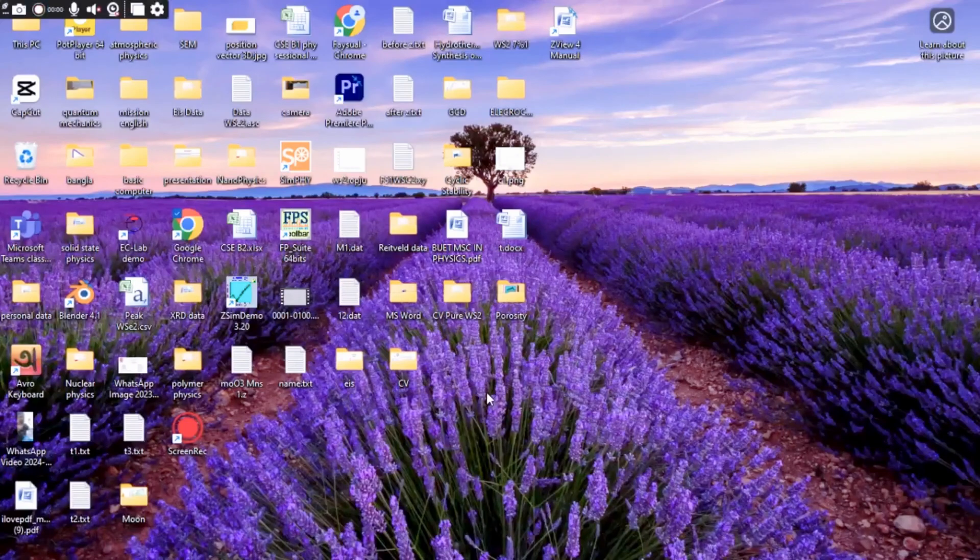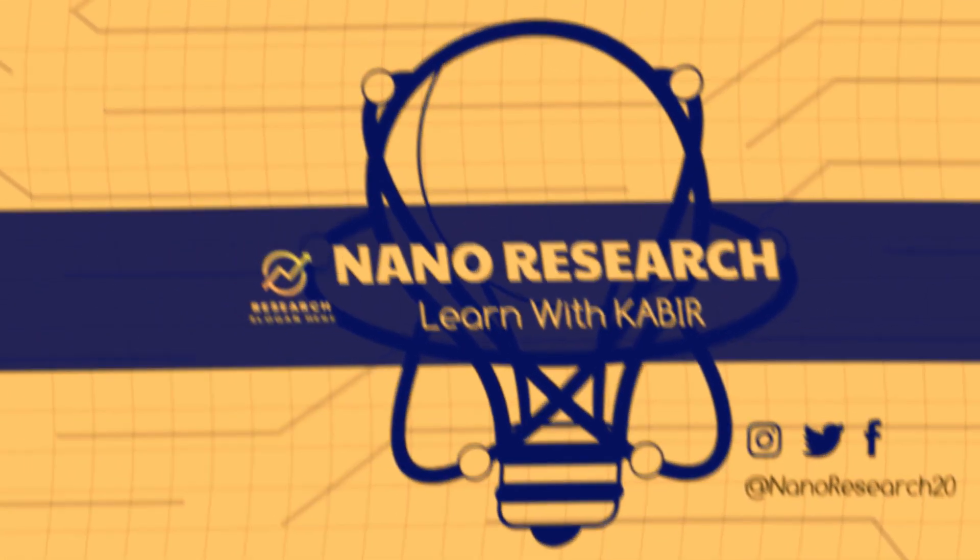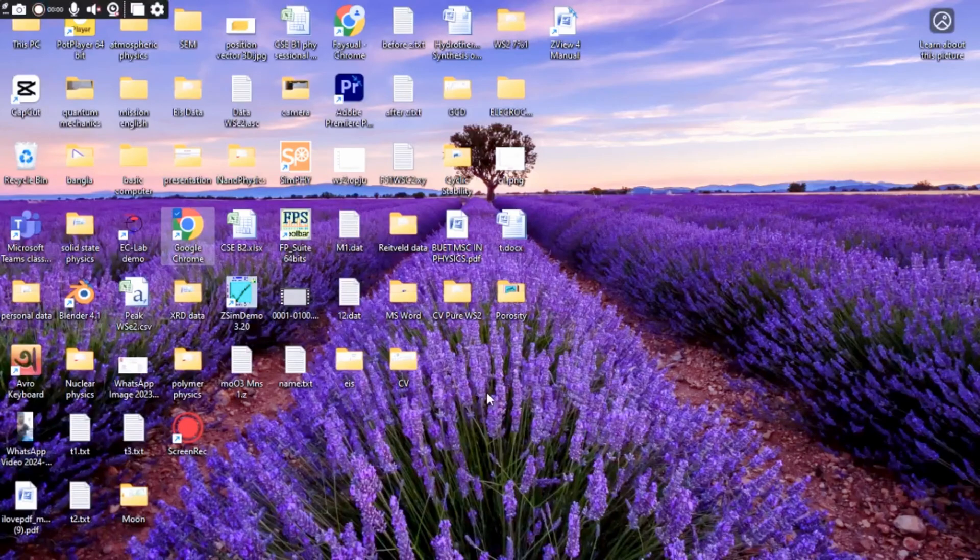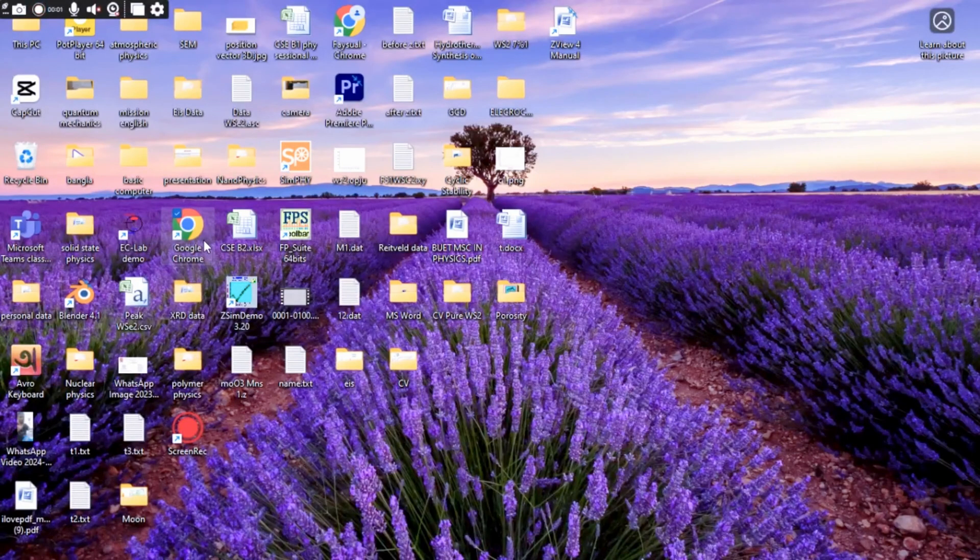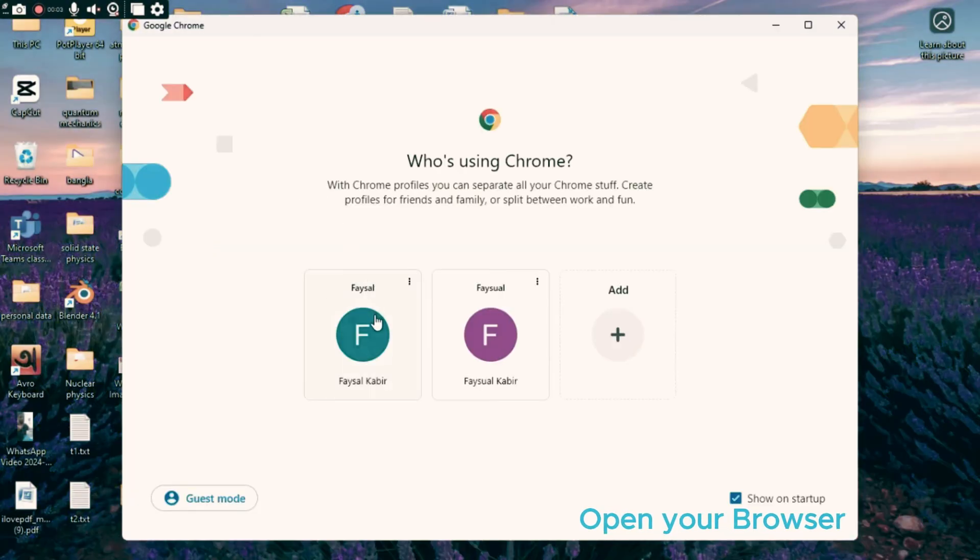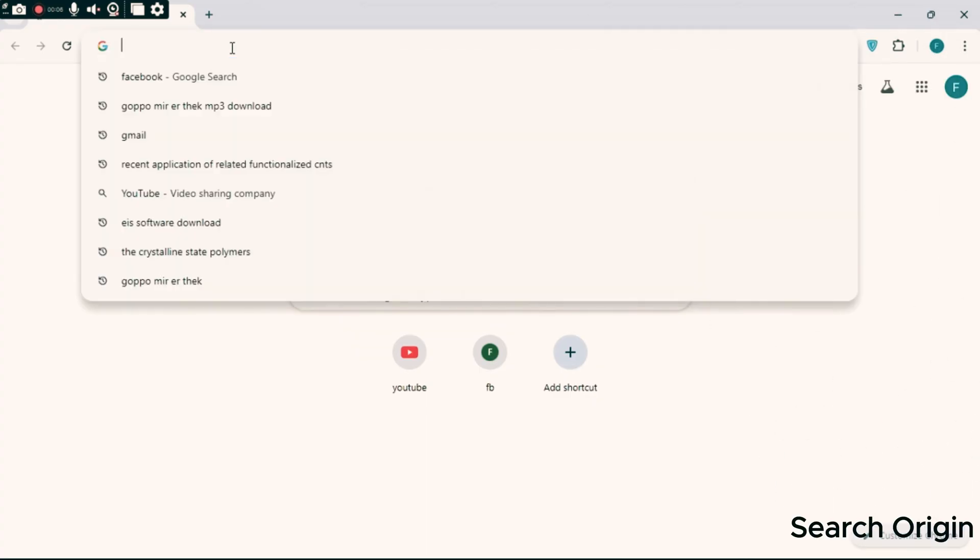Welcome to Origin, one of the most important software for research purposes. To download Origin Lab software, open your browser and search Origin or Origin Lab.